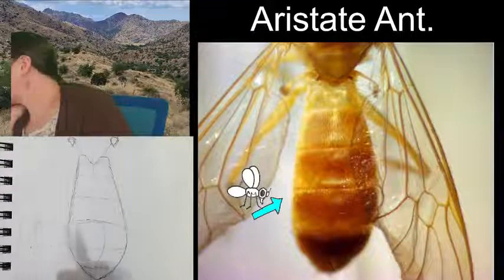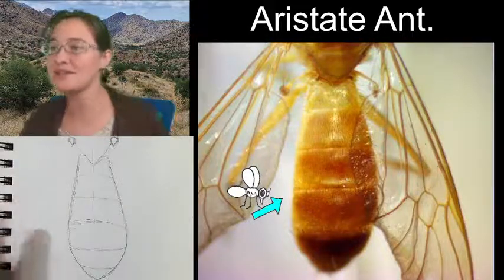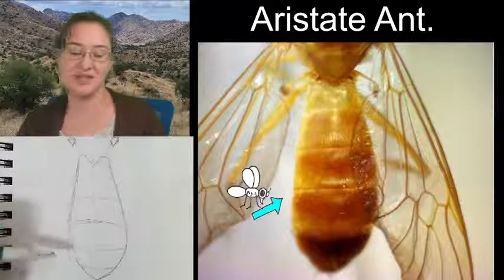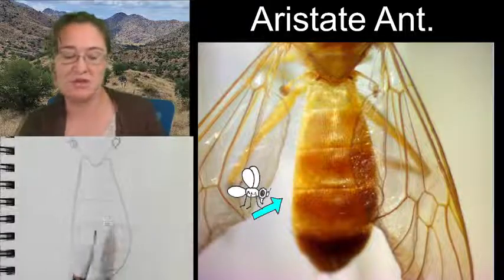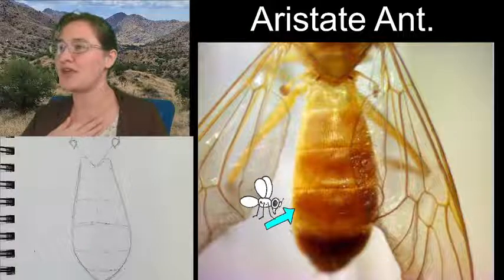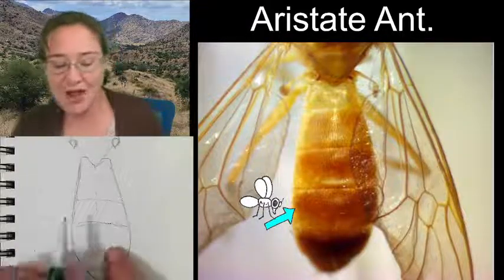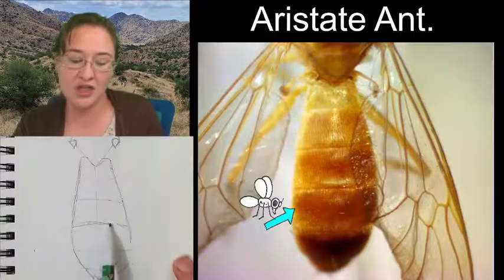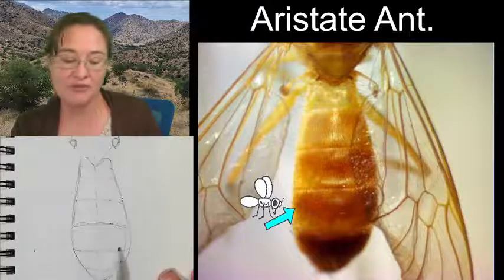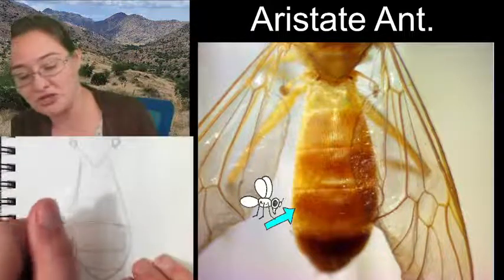The abdomen does curve up and then away from us. So the way that I will generally show that is I find the largest segment, or the segment that should be closest to the viewer. That's going to be this one right here, segment number 4. So this is A4. And on this one, I have the arch of the segmentation going up and the bottom of it going down. So that's going to say, oh, this is the largest one.